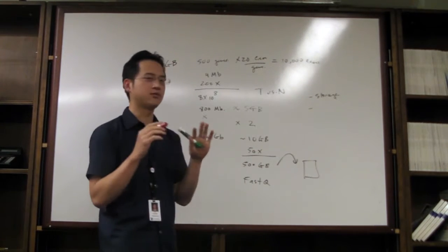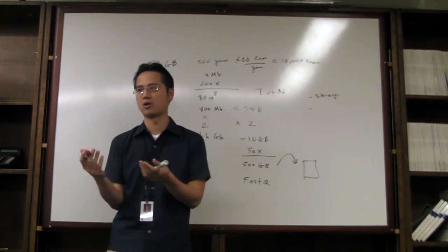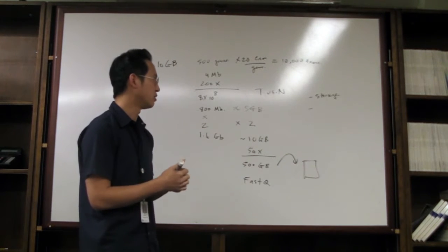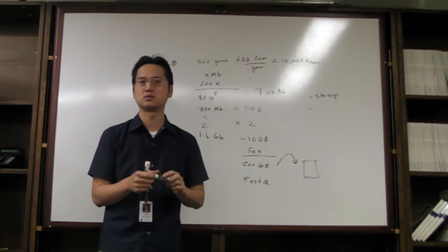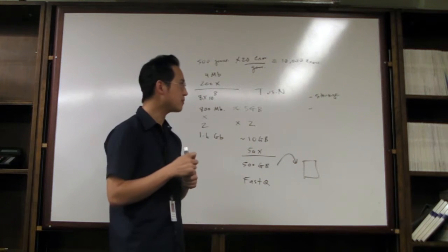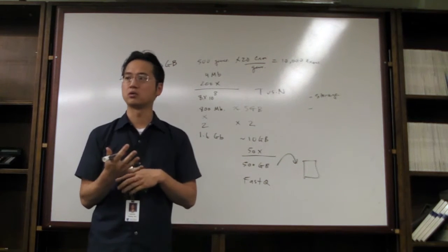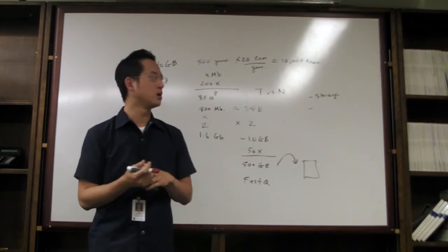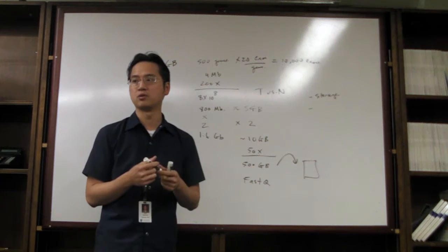So let's just say you have your 2 cores of processor and you have 8 gigabytes of RAM, enough to do this mapper. On that computer, it'll probably take you a few days to run, just to map, a few days. If you give it a little bit more computing power, say 8 cores or 12 cores with that amount of RAM, it'll probably complete within 2 hours. So it takes a lot of computing power to do that.